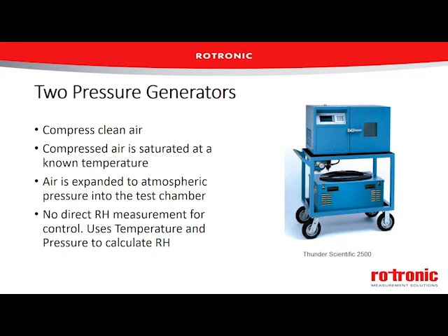Two-pressure generators are exactly that. They use two pressures to generate different levels of relative humidity. If we recall back to our relative humidity basics or theory class, and by the way, if you missed that, you can watch the on-demand recording at the Rotronic Measurement Academy online. But if you recall Dalton's law of partial pressures, and basically, without going into it in detail, the relative humidity does change proportionately to the actual pressure difference.